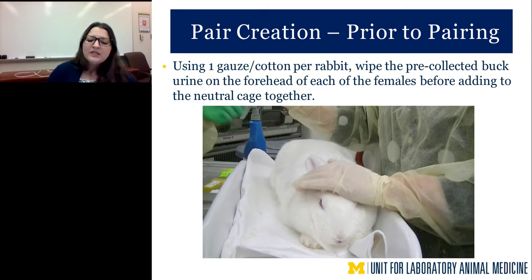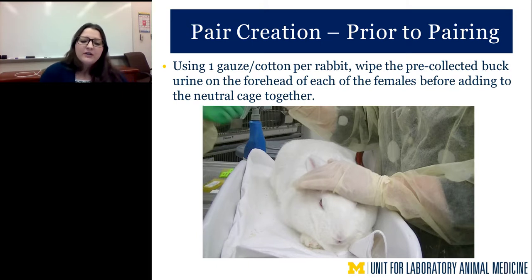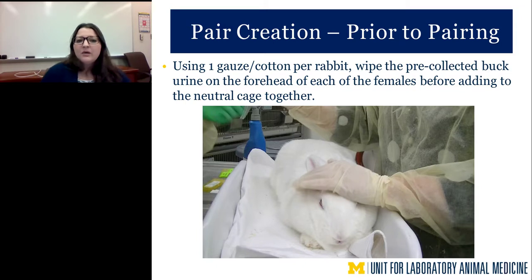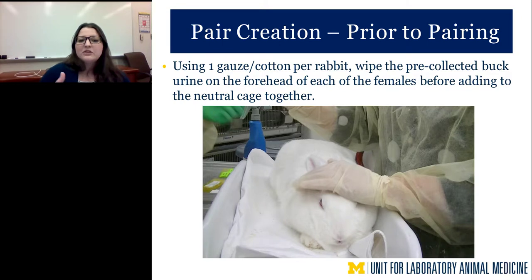The last step before placing the females together is marking each female with the pre-collected urine. Add a generous amount to a cotton ball or gauze pad and place it on the rabbit's forehead and between her ears. After marking each rabbit with urine, add the animals to the neutral cage together — no more than a couple minutes apart — to prevent any one animal from establishing the cage as her territory.